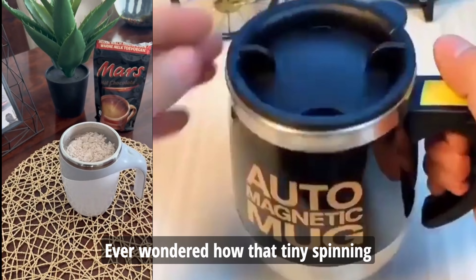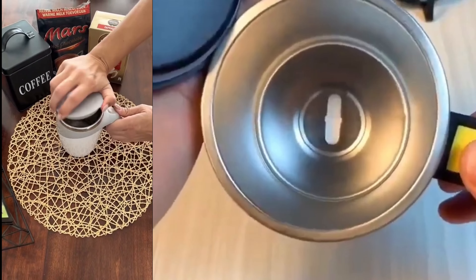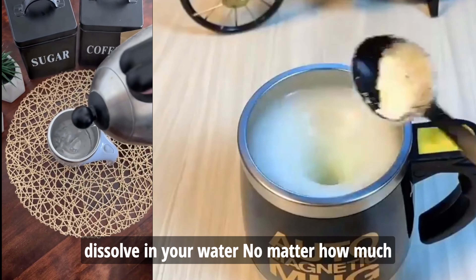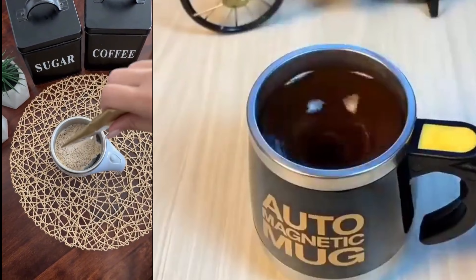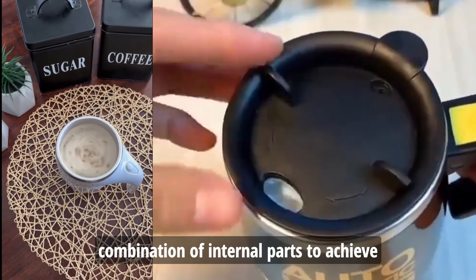Ever wondered how that tiny spinning thing inside the flask works its magic? Imagine a world where sugar just won't dissolve in your water, no matter how much you stir. Frustrating, right? A magnetic stirrer uses a clever combination of internal parts to achieve this magic.